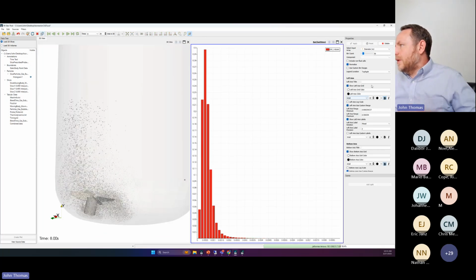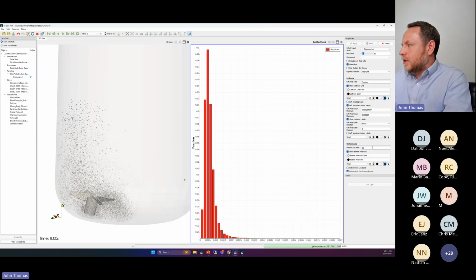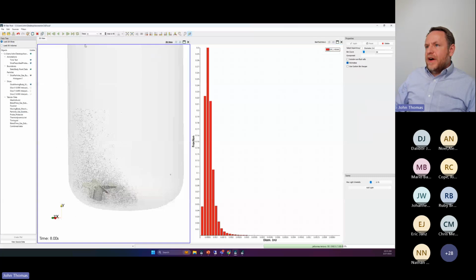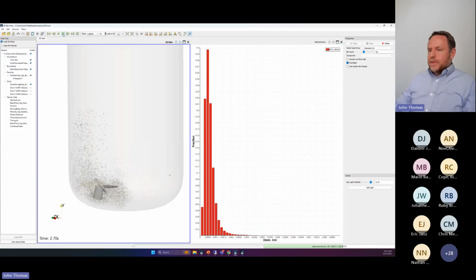Just to illustrate what I'm showing here, this left axis is like fraction. That's the fraction of the bubbles with a given diameter. And that diameter is measured in meters. So here I'm watching my histogram evolve and snap into place. Now there is coalescence going on, so I get some big bubbles up here. But foundationally, I'm just watching this guy spin and converge towards its steady state.